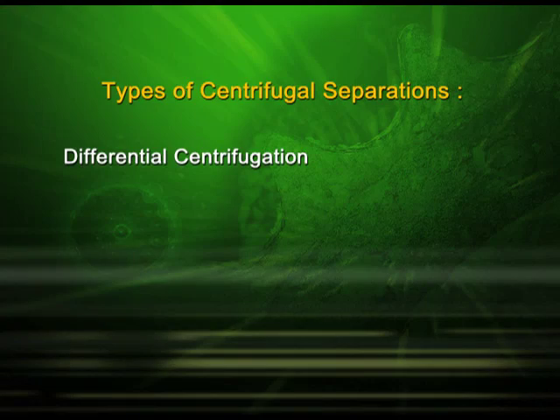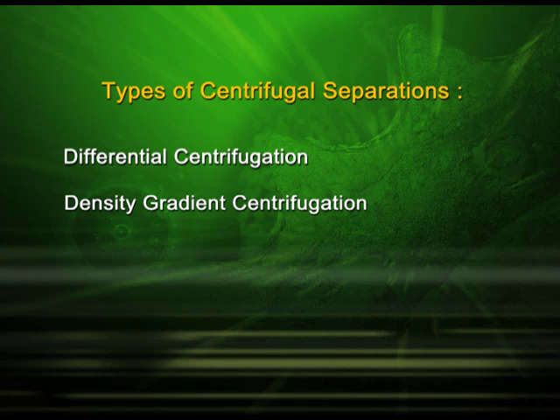In the last episode, we had discussed about centrifuge, the principle involved in centrifugation, and we also had discussed about rate of sedimentation. Now, let us discuss the types of centrifugal separations. There are two types of centrifugal separations. The first one, differential centrifugation, second one, density gradient centrifugation.